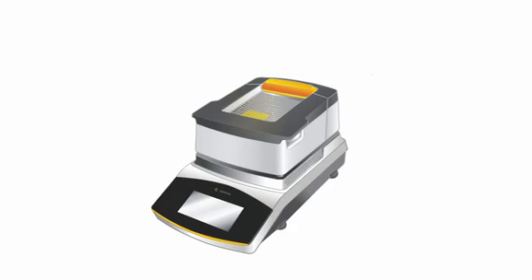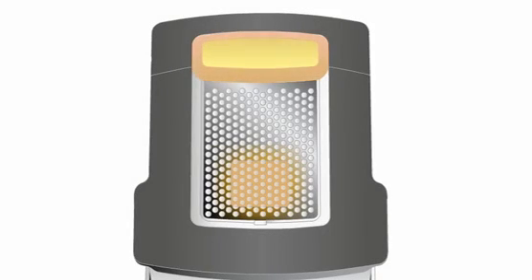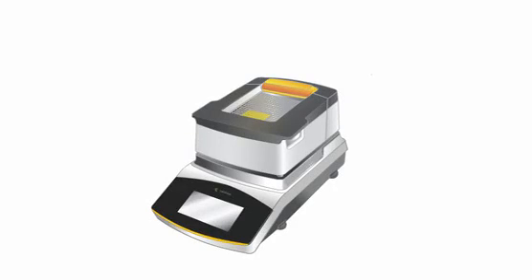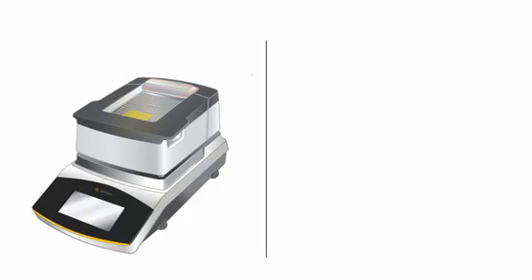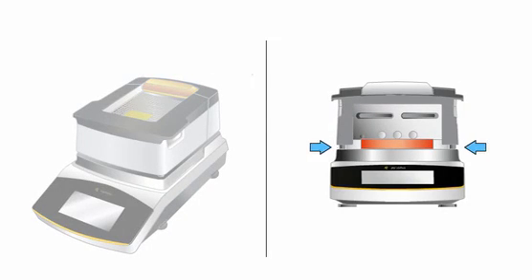The moisture analysis starts. The pulsating status light shows you also from a distance that a moisture determination is performed. Through the inspection window, you have the sample constantly in view. The integrated draft shield allows you faster and more accurate analysis, independent of the air drafts caused by the environment.